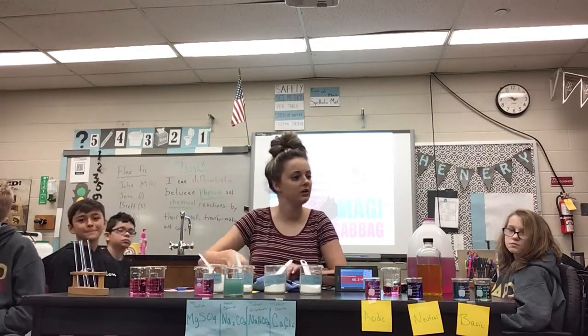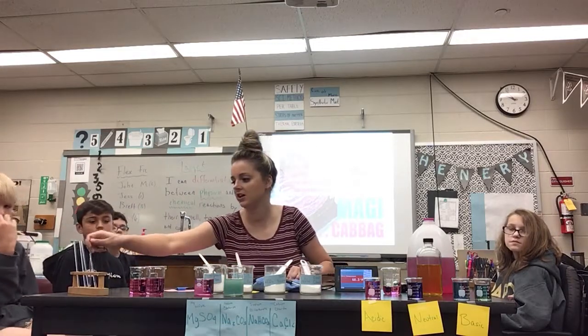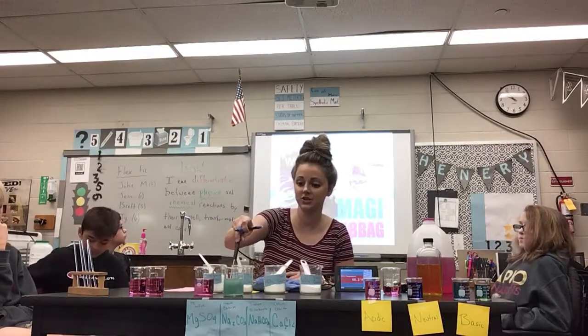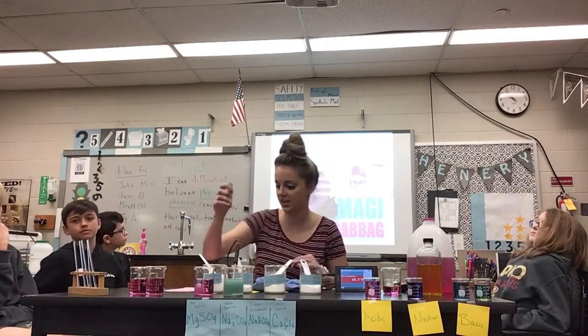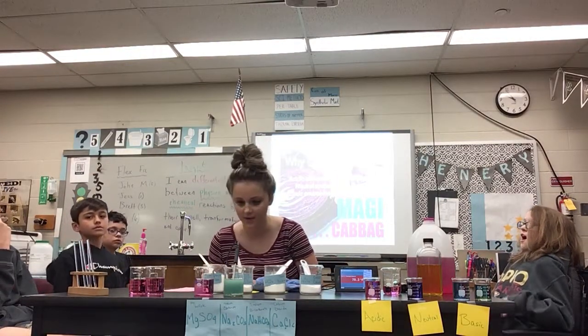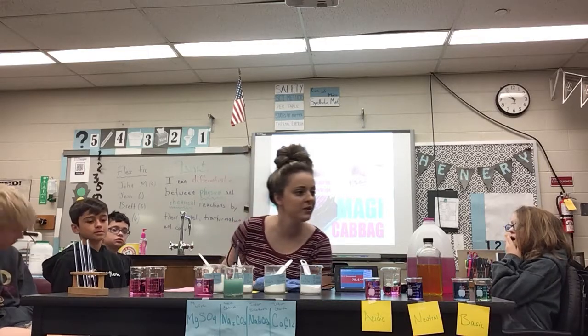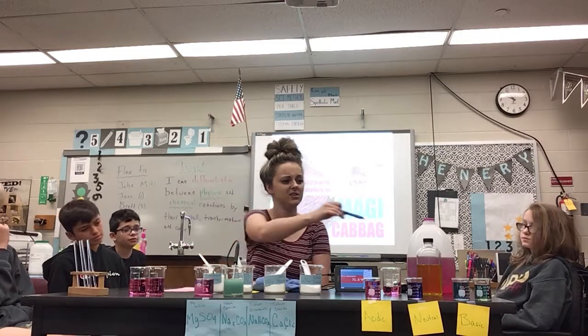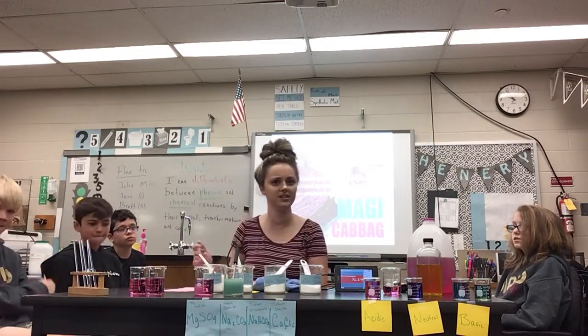So, look at your options for colors. While we wait for the temperature to start to indicate, was there a color change? Yes. Therefore, what do we think? What color does it look? Bluish green, teal, like a teal. So what is it?